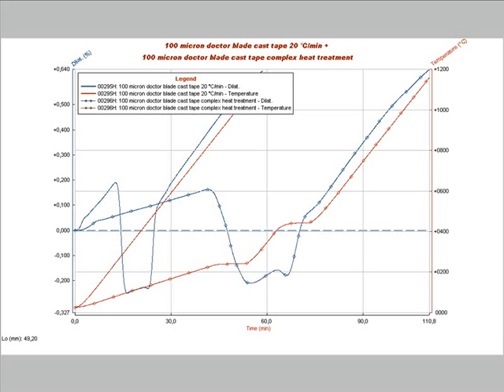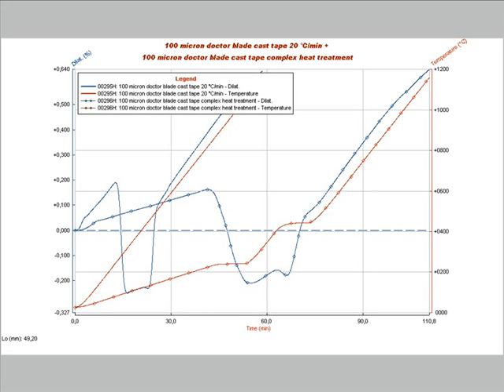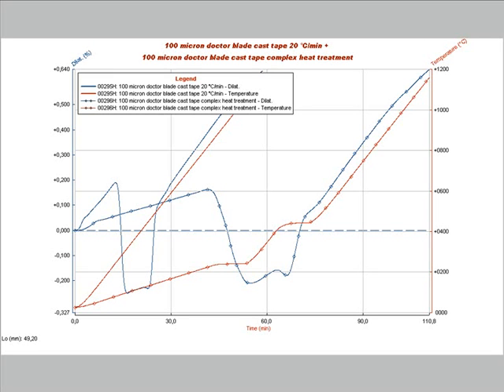This is the graph of the comparison between two tests carried out on the ceramic tape, shown on a time base. The two heat treatments are quite different, since the first is a simple heating ramp with constant heating rate, while the second is a complex heat treatment, which required twice the total time, and it also comprises two intervals at constant temperature, in correspondence with the volume changes.